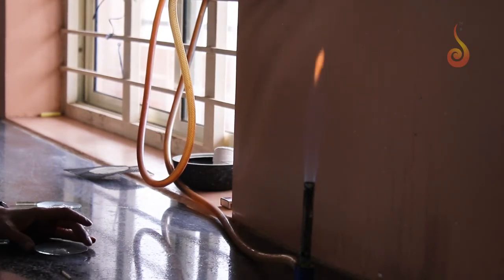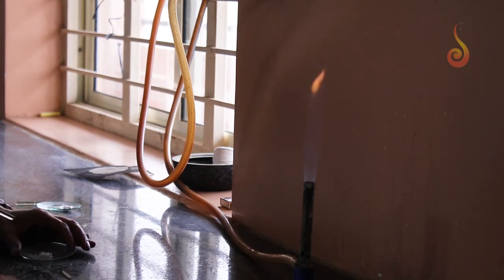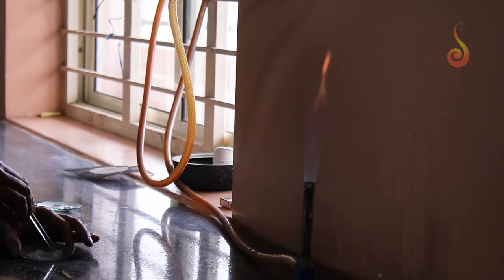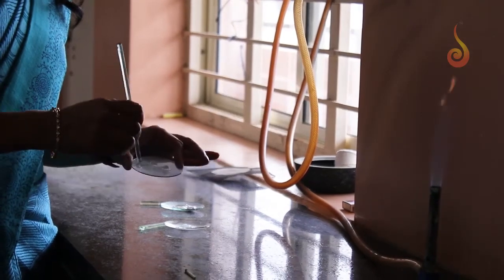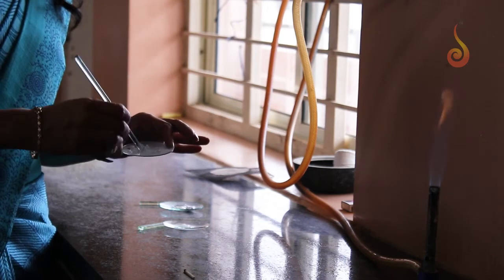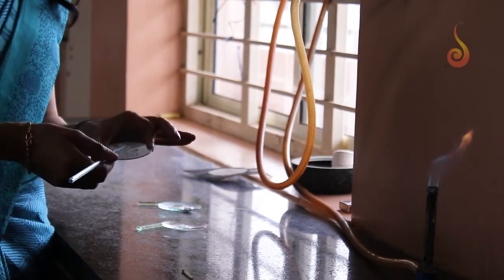The procedure I already told: we have prepared a paste of this salt using concentrated HCl, and the paste will be held in the flame. We have to hold the paste in a non-luminous flame. To what? Non-luminous flame. About the Bunsen burner we'll study in detail in later classes.